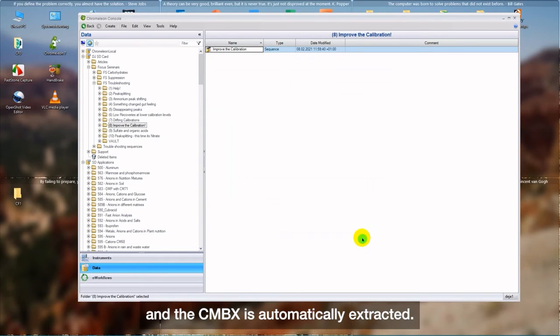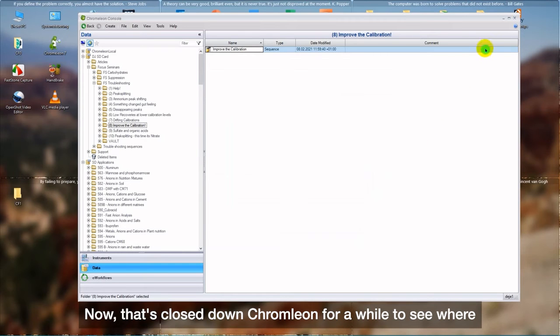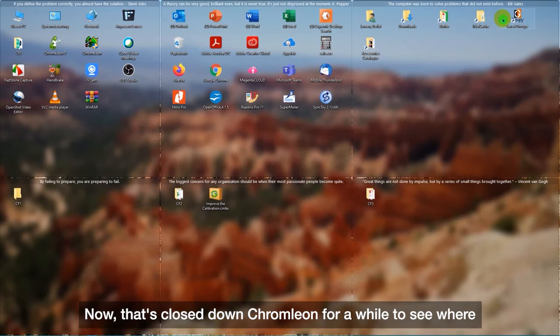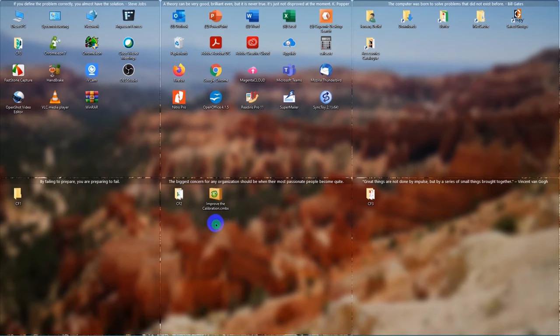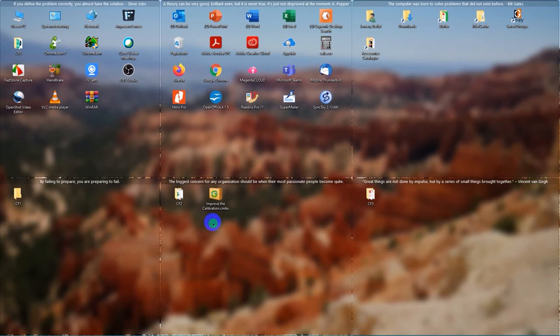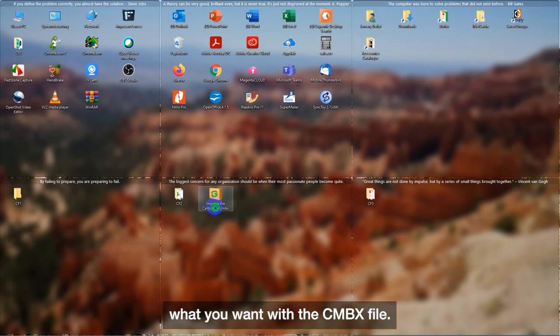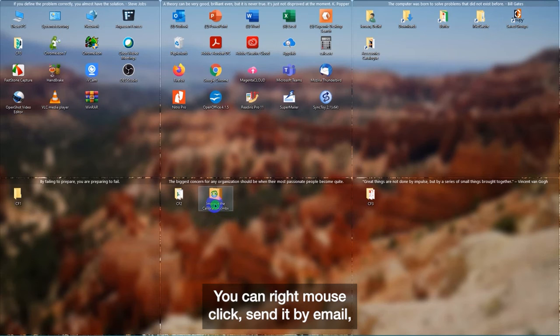And the CMBX is automatically extracted. Now let's close down Chromeleon for a while to see. Boom. The CMBX file has been created on the desktop.